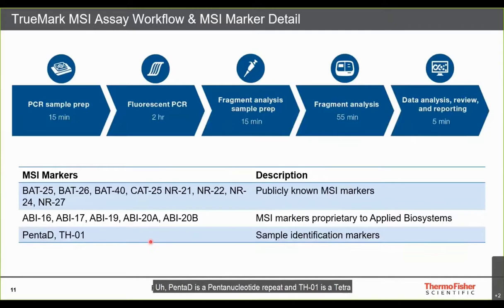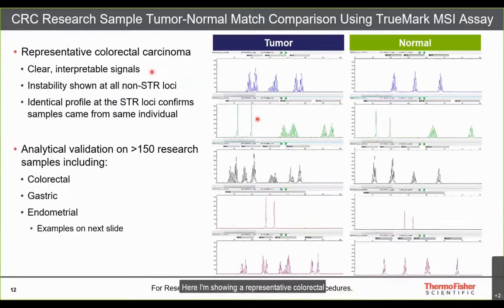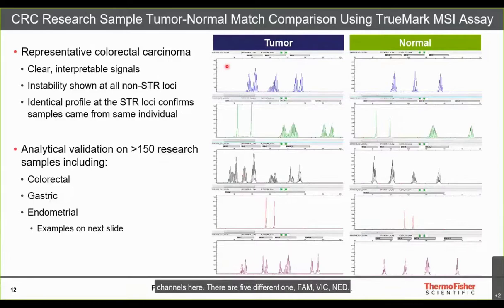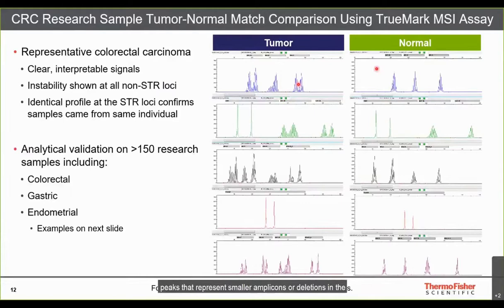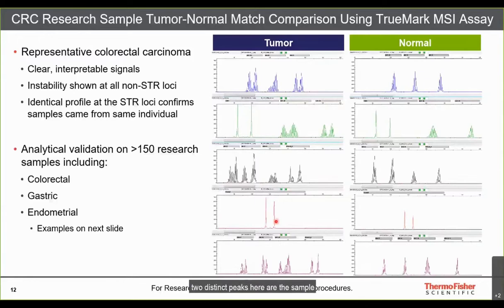A representative colorectal carcinoma figure shows all five dye channels — FAM, VIC, NED, PET, and LIZ. In the tumor sample, extra peaks representing smaller amplicons or deletions are visible at each MSI marker. The two distinct peaks are sample identification markers, showing the same allele in both tumor and normal — confirming both samples came from the same individual.